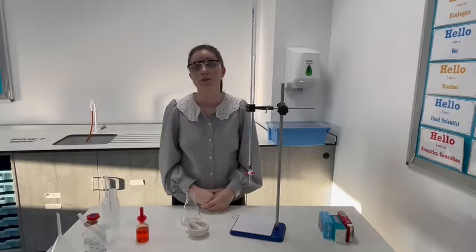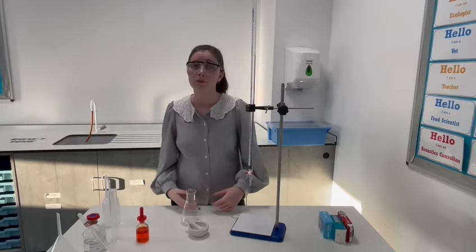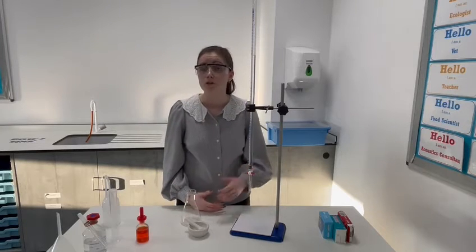So a nice way for students to start this practical is by conducting some research. So they can research what is indigestion, and this will link directly to their learning of the human digestive system. They could research what is in an indigestion tablet, what are the active ingredients, and this will link directly to their knowledge of formulations from chemistry. And of course they can research what is neutralisation, how does the tablet actually work, and that would link to both the human digestive system and to neutralisation and the pH scale.